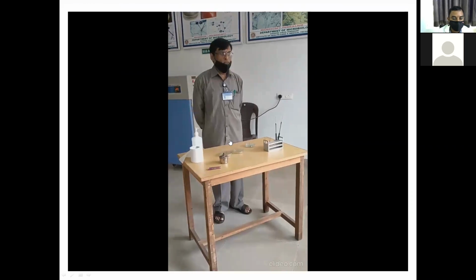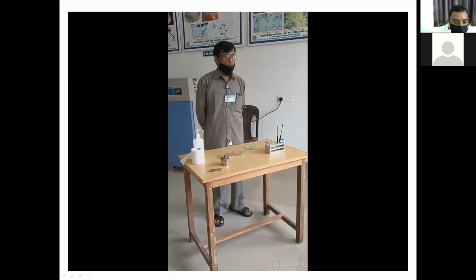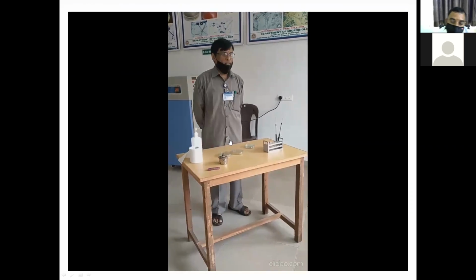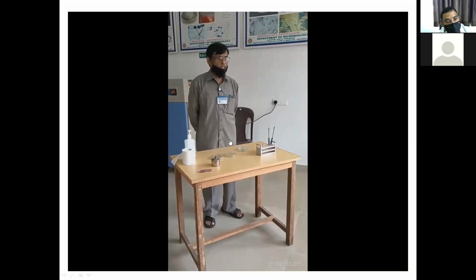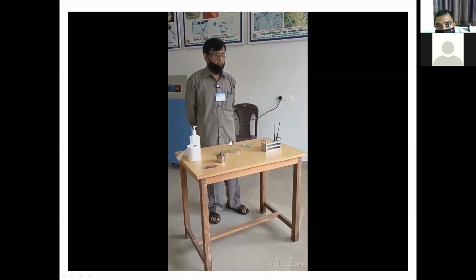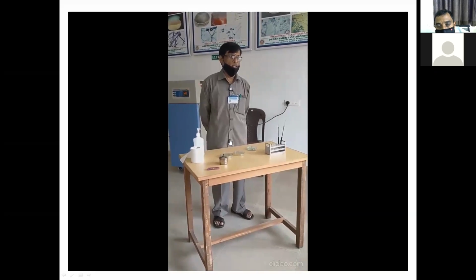So you must know, before doing this technique, what the slide culture is and what its uses are. We are now going to do diagnostic tests for fungi. That's why this slide culture technique is a diagnostic test for fungi. If you identify bacteria, you will do so many tests, including biochemical tests, agglutination tests, and all these things.